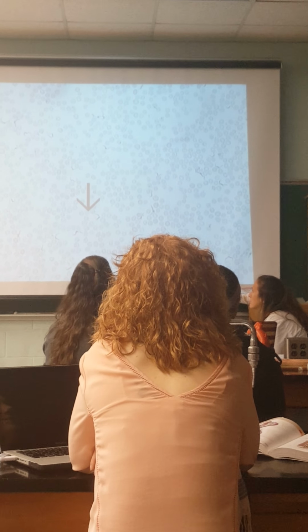You see those squiggles? Those are like little worms in the blood. It's not too much of an issue until it gets to your brain. They can cross the blood-brain barrier, so they get into your brain and make you very drowsy and very sleepy, to the point where you die. So this is not healthy blood.